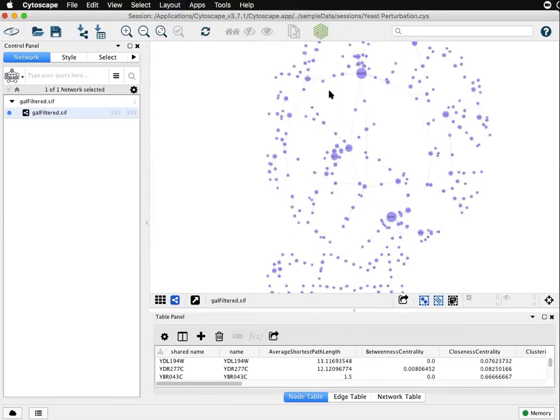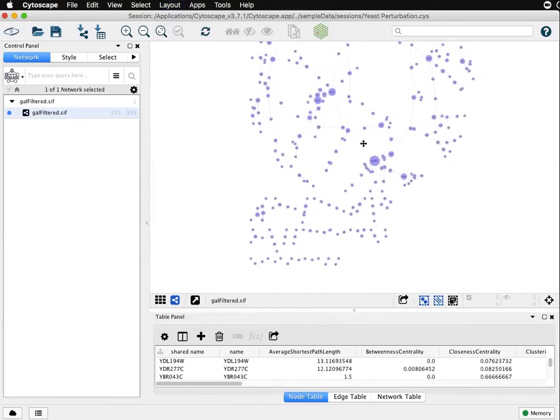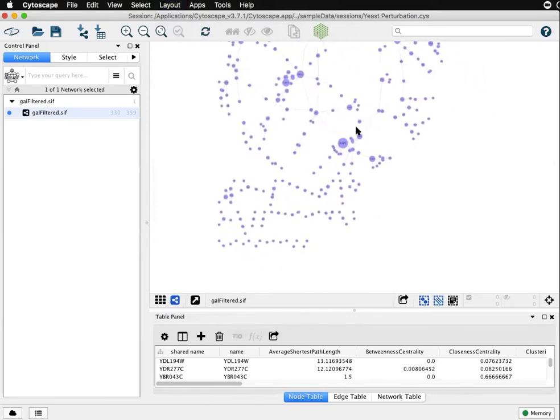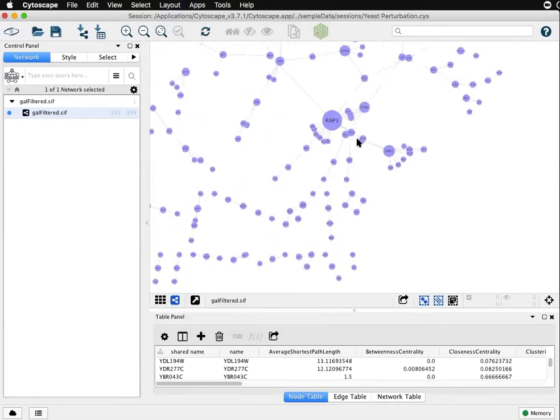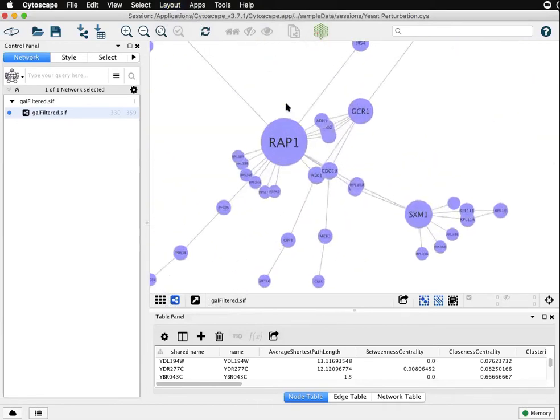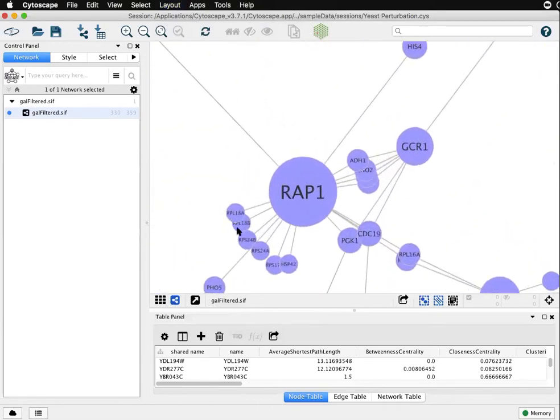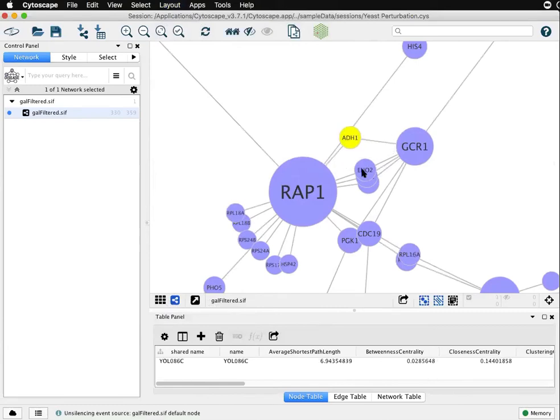Now the final thing I want to demonstrate is the node layout tools. If we zoom in to a particular area you'll see that sometimes there's overlapping in the nodes and the node layout tool is a handy way to fix that without having to manually move each node and fix it.